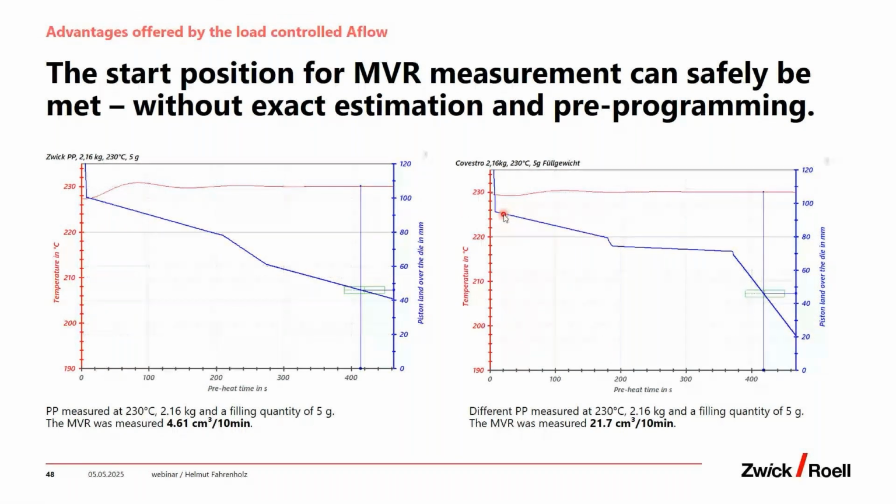Here we have maybe just the weight of the piston. We do a first measurement. We see that under my selected weight, it will run quite fast. So I stop it until here, and then we release at 360 seconds and it goes down and still meets the window.